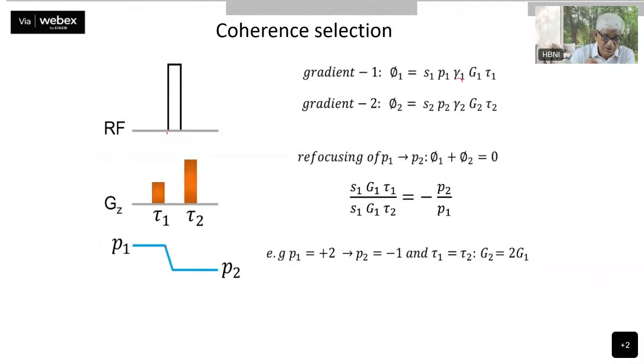Okay. Now, when I apply this pulse, what happens? This coherence is converted into P2. What was the example? The example was in double quantum filtered COSY. So after the first two pulses, you have converted the single quantum into a double quantum signal. Therefore, the pulse can convert a single quantum into double quantum or Z magnetization into single quantum. All these things can happen, right? Let us assume that this particular pulse here converts this P1 into the coherence order P2. So this point matches here.